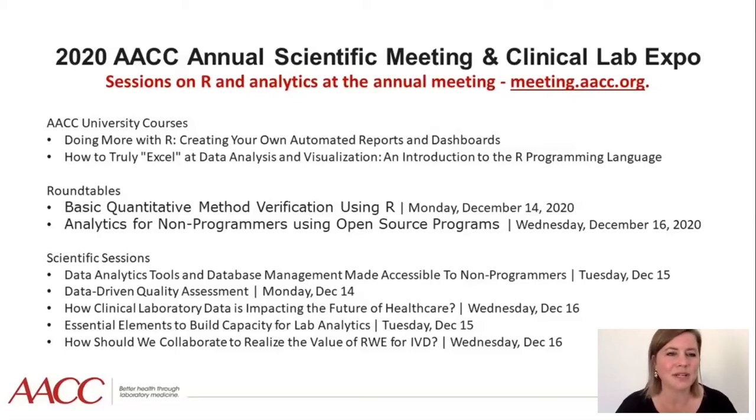Daniel, Herman, or Patrick, any thoughts about getting started with R? Or, we also had a really great question about how, if someone is starting out and learning R, how do you find mentors? Maybe that question was about having somebody look at your code or troubleshoot your code for you, which can always be helpful, and it's typically because you've capitalized something or included a space or a comma or left out a bracket. So what do you think about providing mentorship and education and how people can get started?